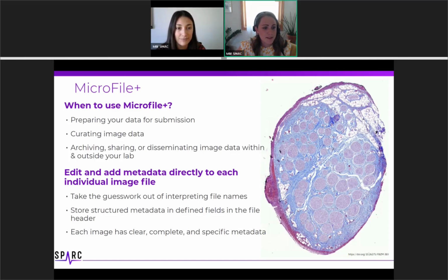I'd also like to point out that describing this at the study or data set level is not usually enough because a single experiment can utilize multiple imaging modalities or experimental parameters. Each sample can include different stains or target labels, image scaling, objectives, or be taken from different devices. For this reason, the best suited location for this information is right inside the image file, independent of everything else.